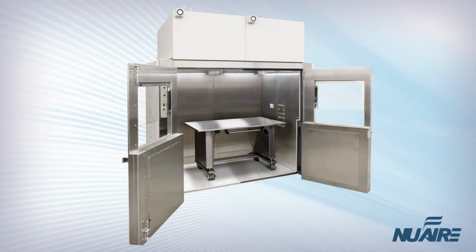And then also thinking about things like the clearances like Bill had mentioned, where if you need service ports or the equipment needs to come out on a regular basis, you need to have a lot of clearance in front of the cabinet, potentially more than you would need for a standard biosafety cabinet, because you could have large double doors that open and a big work surface that can roll out. And also, as Jim mentioned, if it needs to be connected to the building exhaust system, it needs to be placed or constructed somewhere near an exhaust port or an exhaust ductwork that can be adjusted to attach to the device.